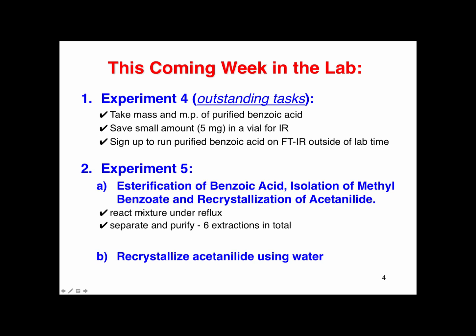So what's involved with the esterification and the isolation of the methyl benzoate? You're going to do the reaction under reflux. So this is a new technique. We'll talk about what's involved in a reflux. And once that reflux is complete, you're going to do the separation and the purification of that methyl benzoate product.